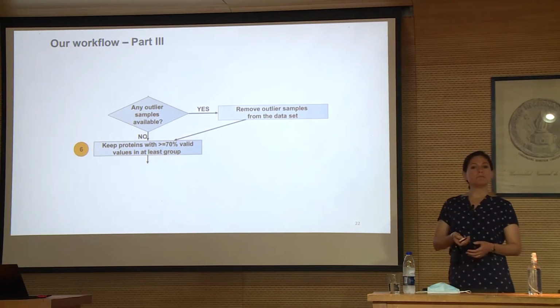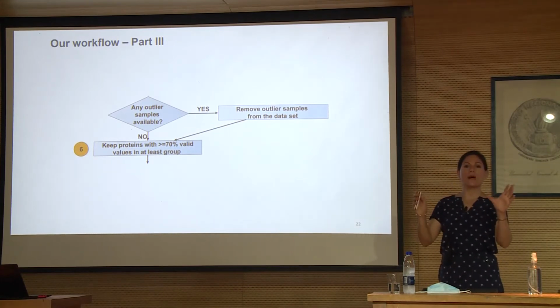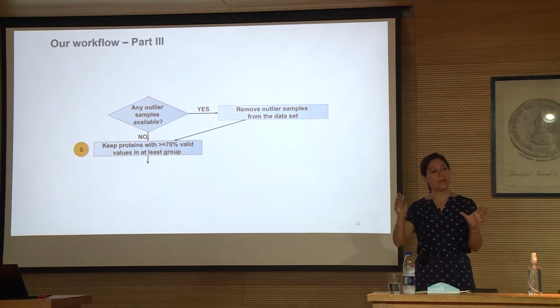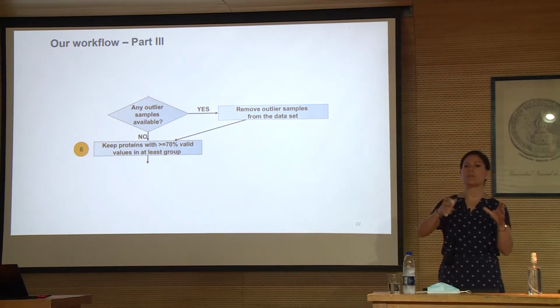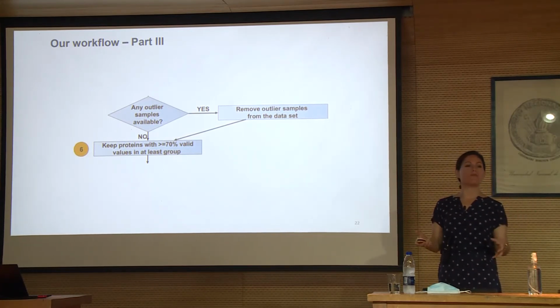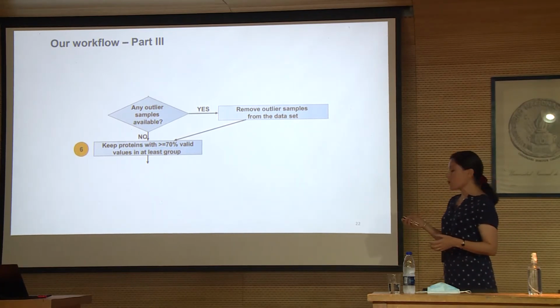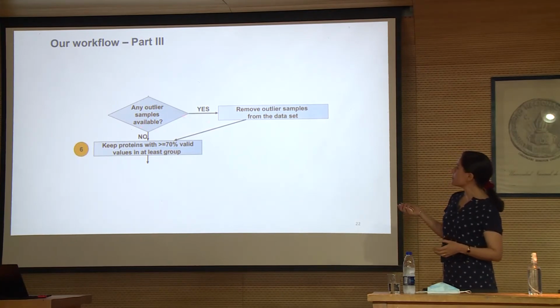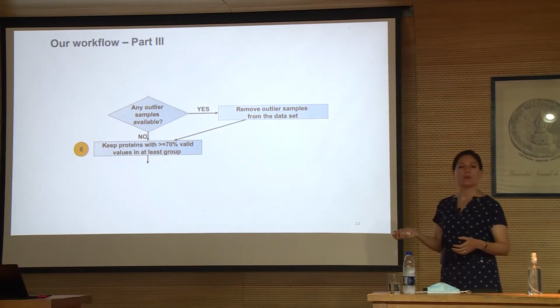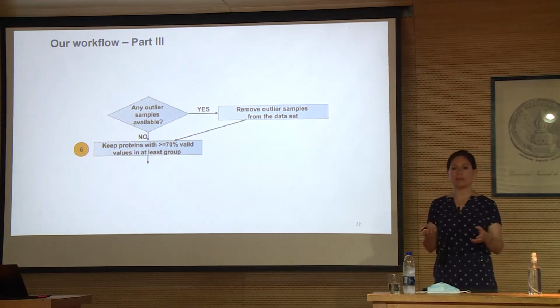Well, then you tried. So now you know with the clusters what you will consider treatment 1 and treatment 2, or according to how many clusters you have, how many treatments the workflow will think you have. Then, well, you take the outliers, that is important, and you have to filter according to how many values you have.